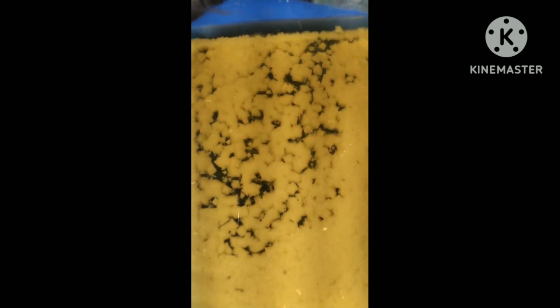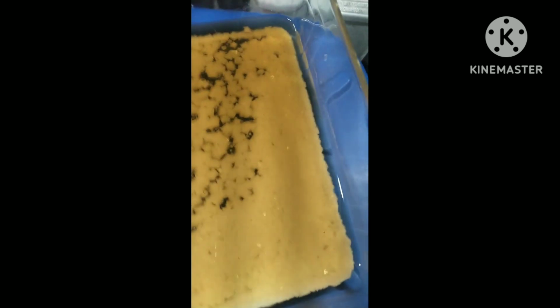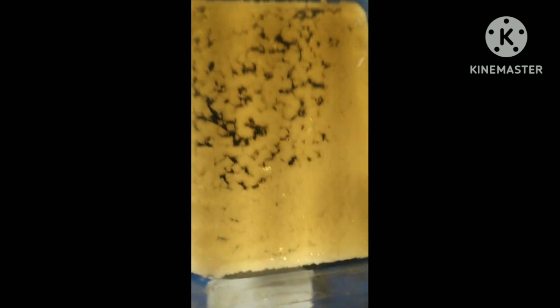And so that's basically it. You just add your cesium carbonate with muriatic acid to fully saturate it. Heat your solution to boiling to boil off some of the hydrochloric acid, and then cool the solution, and your crystals will pop out of solution. That's that part.